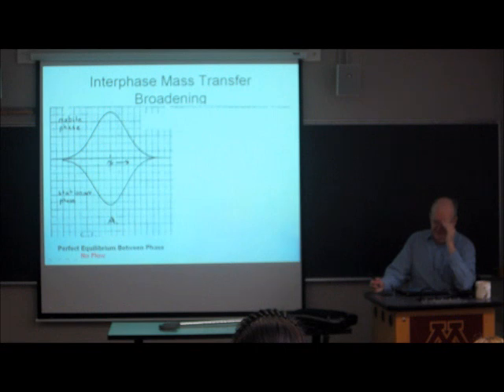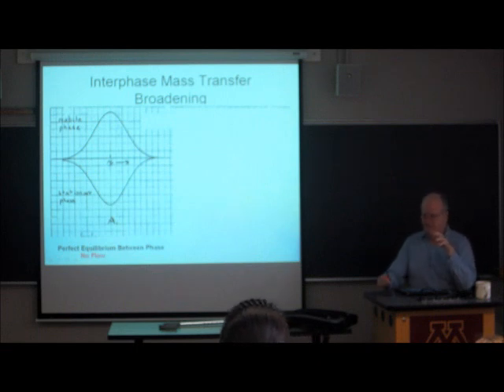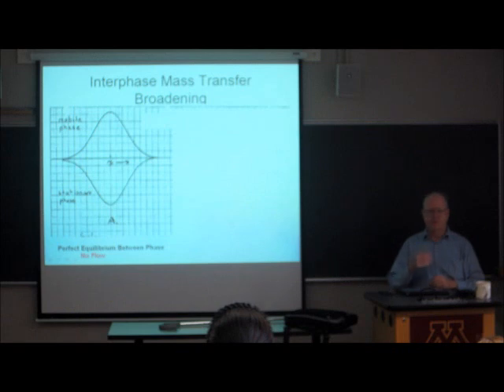One of the processes that we believe is very important in establishing the HETP is the transfer of the solute between phases, from the mobile phase to the stationary phase, through the stationary phase, back out of the stationary phase into the mobile phase.